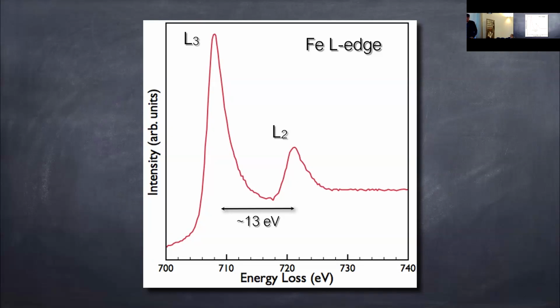Now, how do you measure, for instance, the oxidation state of a material like iron oxide? I think in the 1980s there were 3 papers, by Richard Leapman, Christian Colliex, and another Japanese guy whose last name I don't remember. Before that, they observed, especially Christian Colliex, that as a function of the oxidation state, for instance when you look at iron oxide in different oxidation states, the ratio of the L3 and L2 peaks changes. So you can use that as a fingerprint to pick up the oxidation state of materials locally.